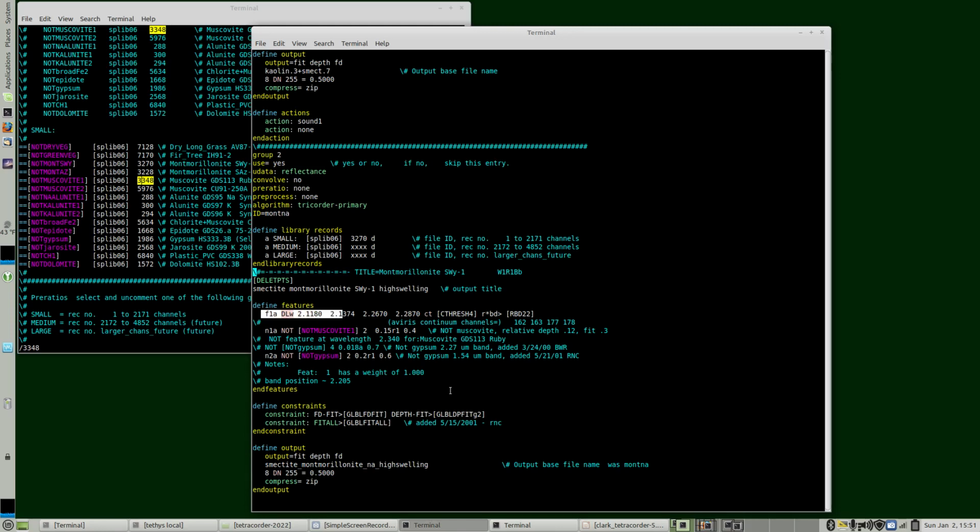Let's say 10 different minerals were plausibly there, that they weren't zeroed out by one of the constraints, and features existed that gave a fit above the thresholds. Then what happens is those fits are compared, and the best fit is chosen.